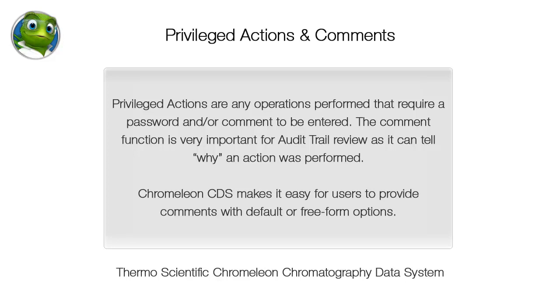Privileged actions are any operations performed that require a password and or comment to be entered. The comment function is very important for audit trail review as it can tell why an action was performed. Chromelion CDS makes it easy for users to provide comments with default or freeform options.